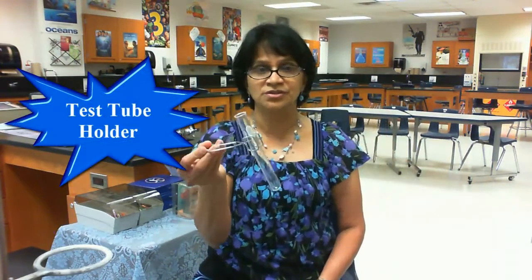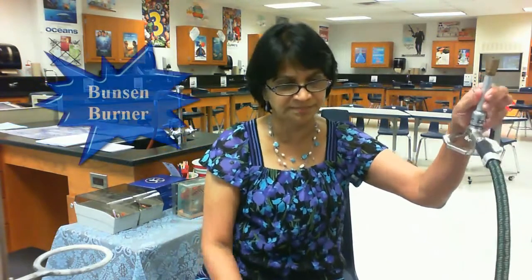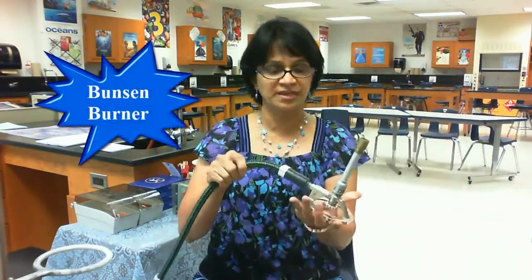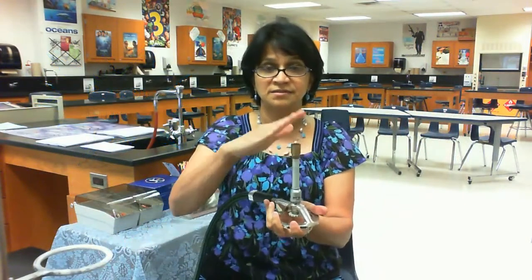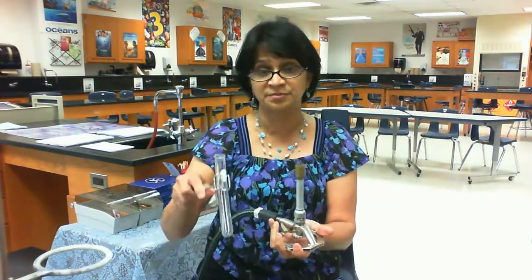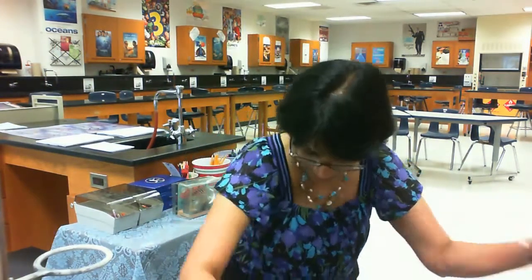Alright, if the test tube is hot, we are going to use something called the test tube holder, and let me show you. That's the way you're going to use a test tube holder. I forgot to mention the burner, the Bunsen burner. This is a Bunsen burner. We get the methane gas through this inlet, and this is used for getting the right flame. We can use the test tube, not holding it in the hand, for a reaction, and if the test tube is hot, you're going to use the test tube holder to grab that test tube. Okay.